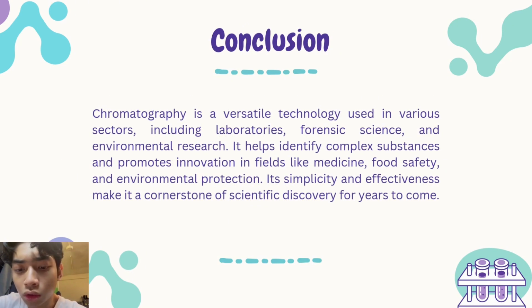In conclusion, chromatography is a versatile technology used in various sectors, including laboratories, forensic science, and environmental research. It helps identify complex substances and promotes innovation in fields like medicine, food safety, and environmental protection. Its simplicity and effectiveness make it a cornerstone of scientific discovery for years to come.